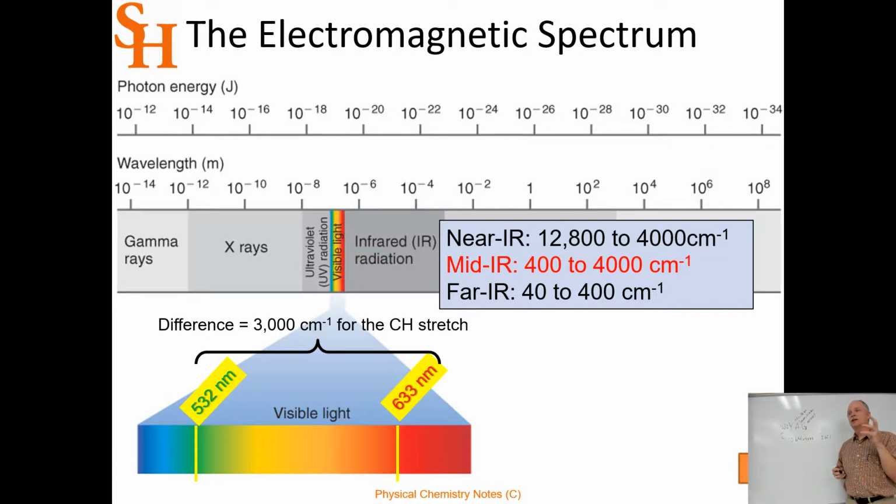There are certain crystals that have what they call nonlinear optical properties. So you send in 1064 light, and the electron cloud oscillates at twice the frequency, or half the wavelength. And it will spit out photons that are half the wavelength. And so you can send this through a frequency doubling crystal and get 532. So that's doubled frequency, or half the wavelength of the 1064. And that's a green laser. And that's what we have in our Raman setup.